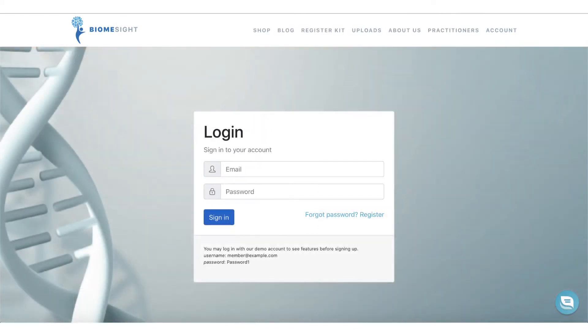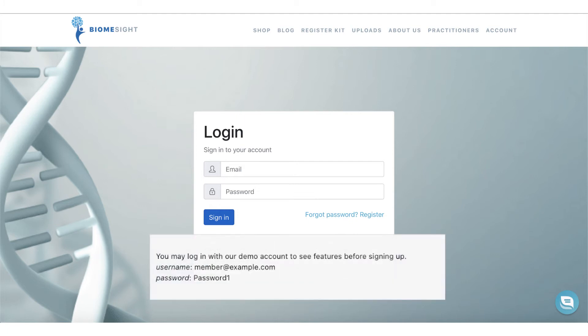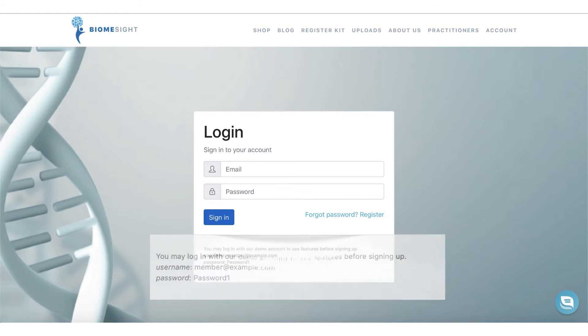You'd access your results using your own account once you've submitted your test, but before then you can use our demo account as detailed here.